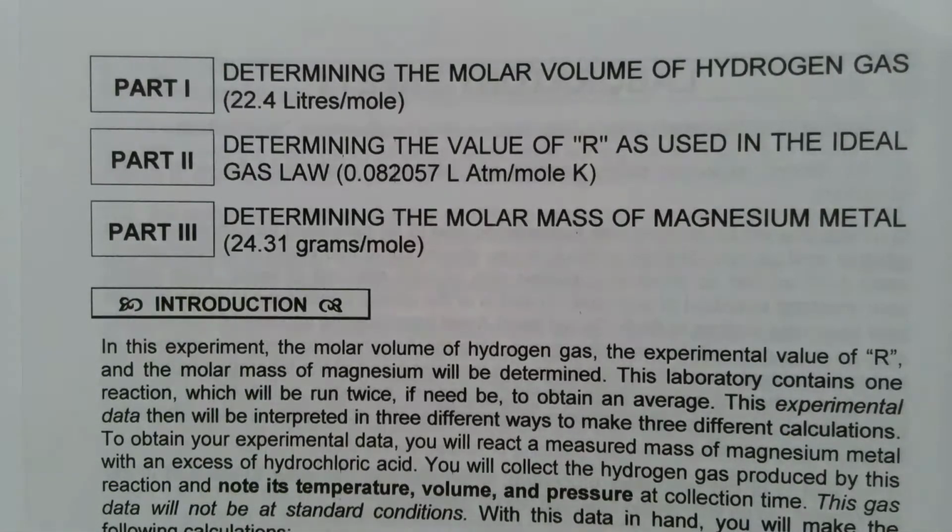Then you're going to take the same data and determine the molar mass of magnesium metal, which should be 24.31 grams per mole. So you're going to do those 3 calculations from one set of data. We'll run the experiment once, get the data, and then you just have to manipulate it to make those computations. So again, just one experiment, 3 very important pieces of data: the molar volume of a gas, the value of R, and the molar mass of magnesium.